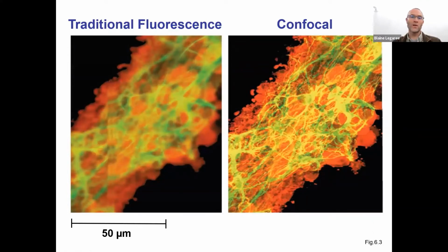The way confocal microscopy works is you have those lasers, and the lasers will allow the specimen to glow or emit light at very precise depths. So confocal microscopy is just a sophisticated type of fluorescence that enhances the image, and then you can build the whole image together in the computer and make a very sharp image. You're looking at $50,000 to $100,000 for a cheap confocal microscope. So I'll show you some more pictures.